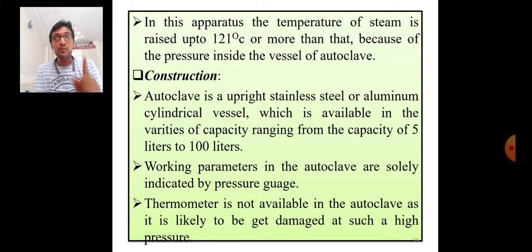Why? Because if you are using the thermometer in the autoclave, जर तुम्ही थर्मामीटर ऑटोक्लेव्हमध्ये ठेवला तर एवढ्या हाय प्रेशरवर तो थर्मामीटर इज लाईकली टू ब्रेक. तो थर्मामीटर त्या ऑटोक्लेव्हमध्ये फुटू जाऊ शकतो, तो ब्रेक होऊ शकतो आणि त्याचं मर्क्युरी जे आहे ते त्या पर्टिक्युलर वेसलमध्ये स्प्रेड आउट होईल अँड इट विल बी हार्मफुल फॉर आवर लॅबोरेटरी. Try to understand.